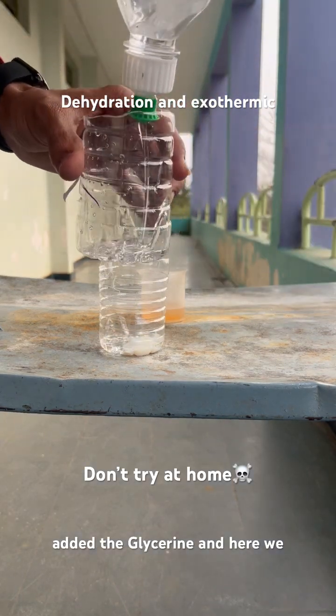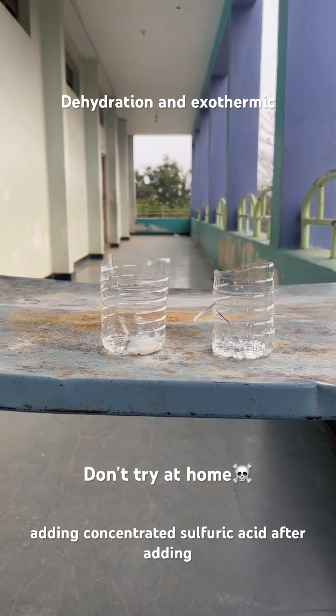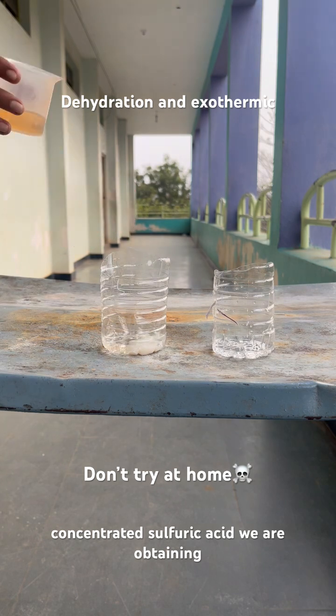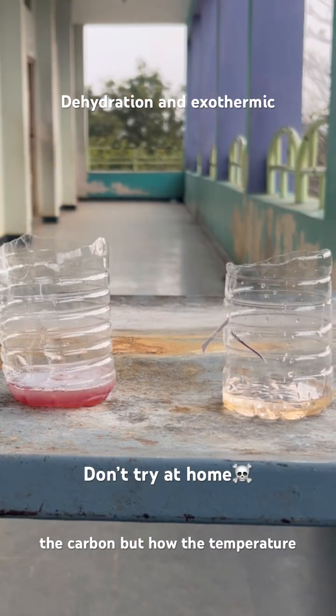We are adding glycerin in both containers, and then we are adding concentrated sulfuric acid. After adding concentrated sulfuric acid, we are obtaining carbon — but notice how the temperature changes.